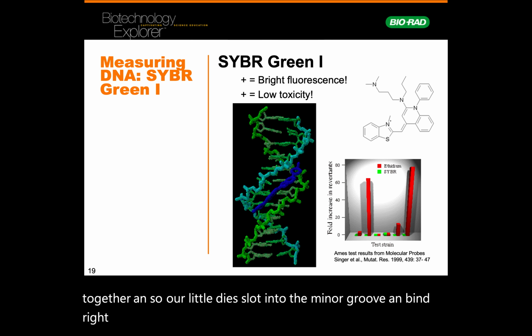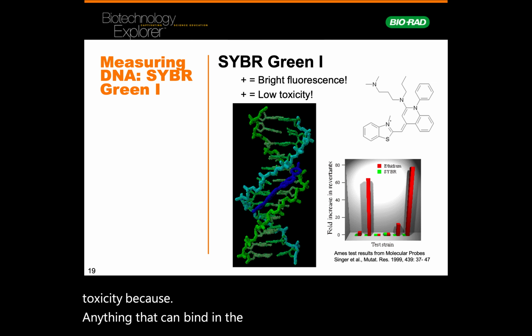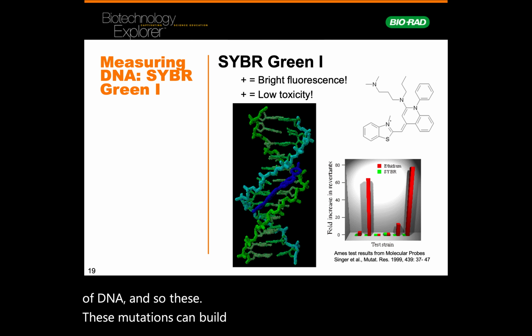Now it says low toxicity up there, but it's not zero toxicity, because anything that can bind in the minor groove or major groove of DNA can cause mutations by binding to the minor or major groove of DNA. And so these mutations can build up and can potentially lead to cancer.